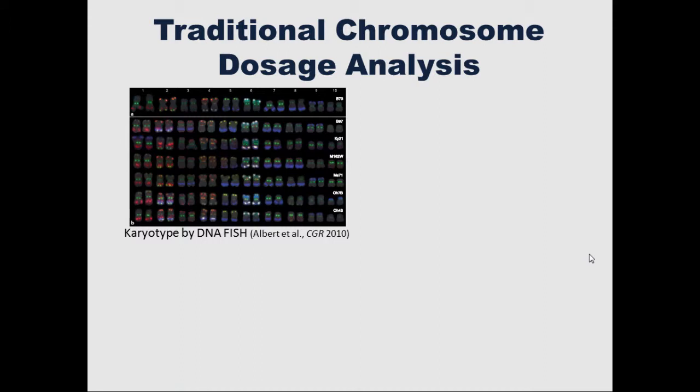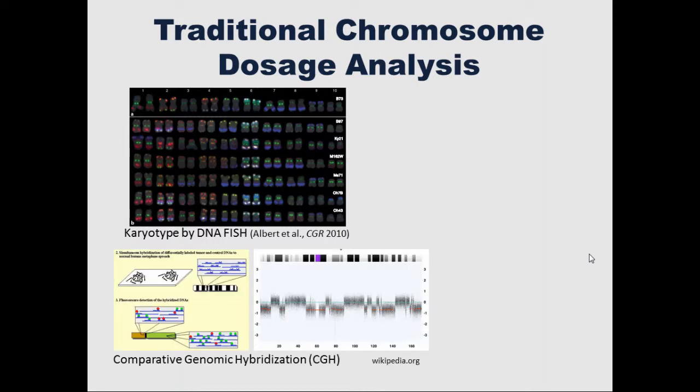And secondly, there's a technique called comparative genomic hybridization, or CGH, that's used a lot in human panels. In this technique, you basically put DNA chromosomes from a normal karyotype on a slide, and then you hybridize it competitively with wild type and usually tumor. And you can then plot the changes depending on the competition on the array.